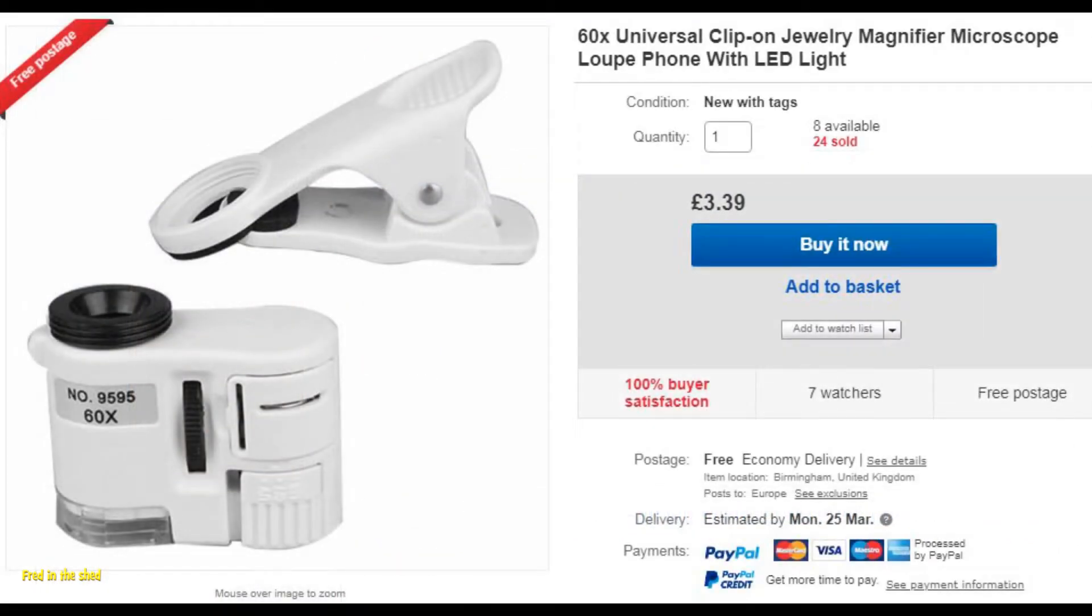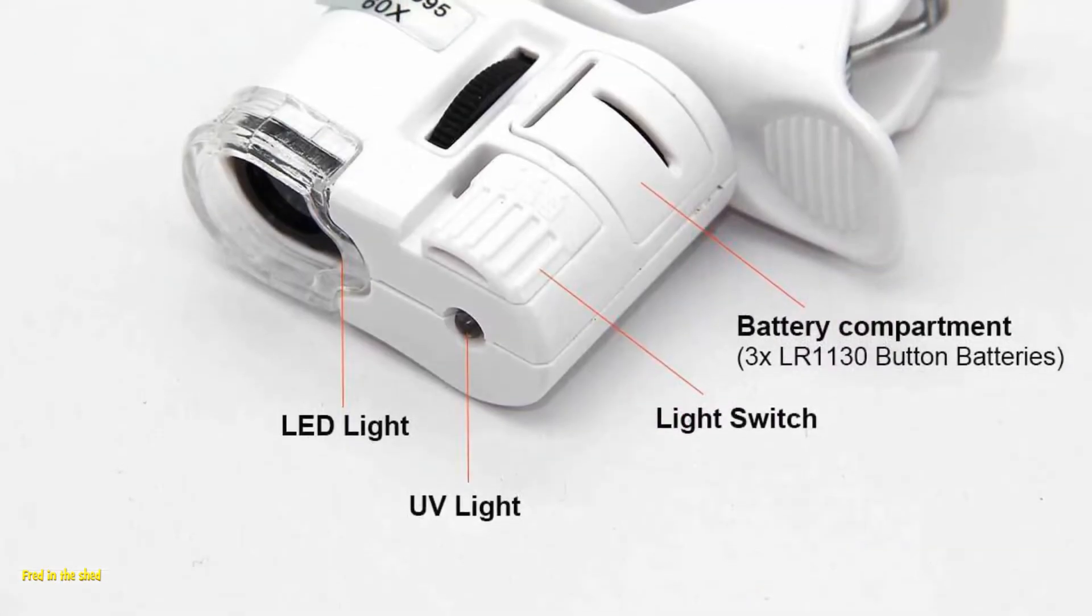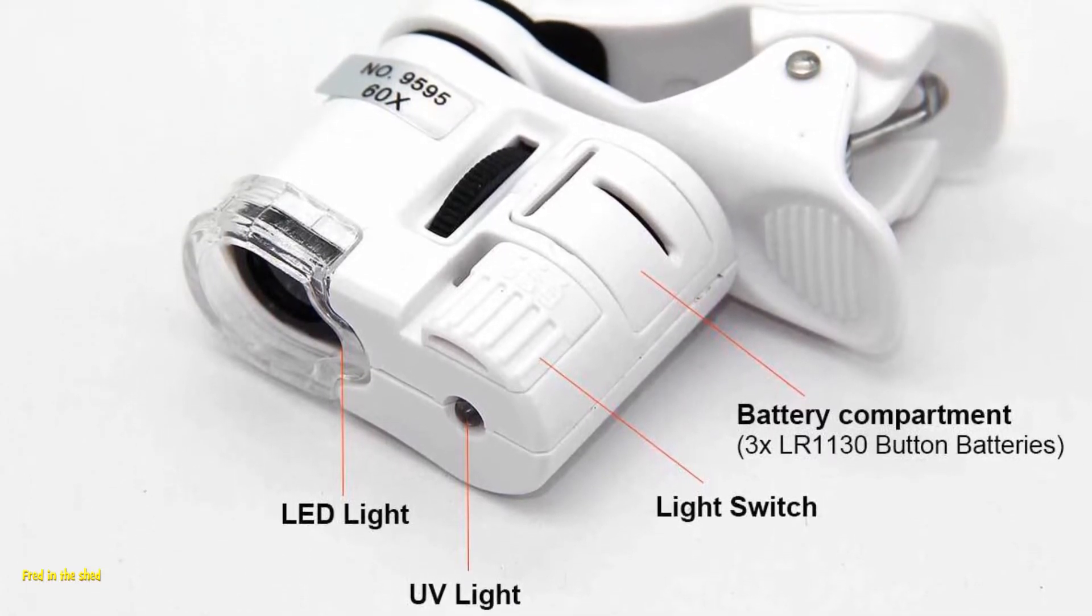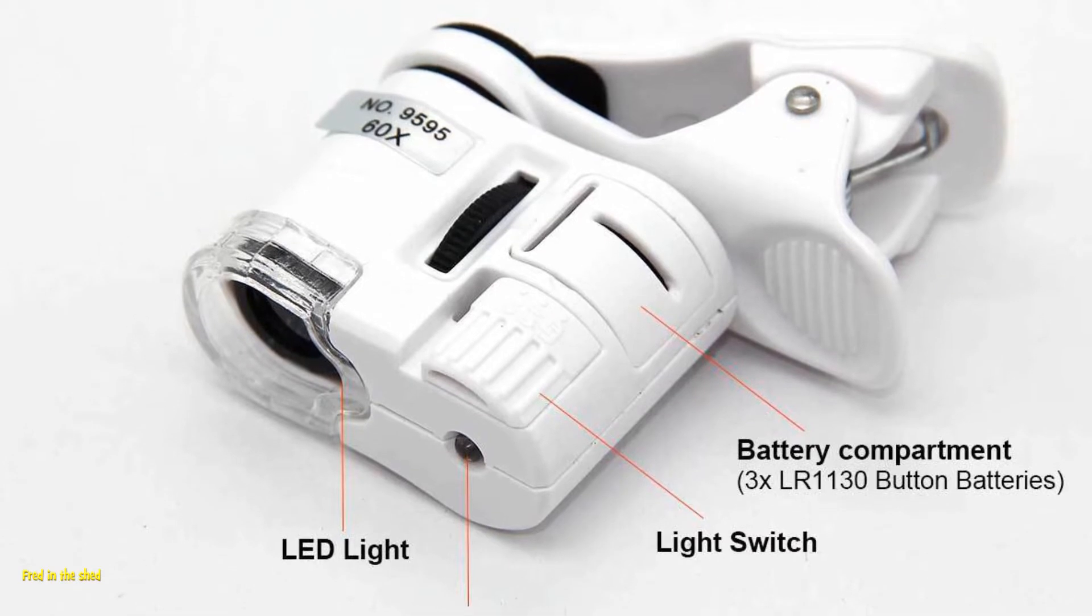We're now talking pocket money prices. This is the one that I settled on - just over three pounds delivered from the UK, so you don't have to wait that long. When I looked at the spec on this, it's got a built-in LED light which is very useful, but it's also got an ultraviolet LED.